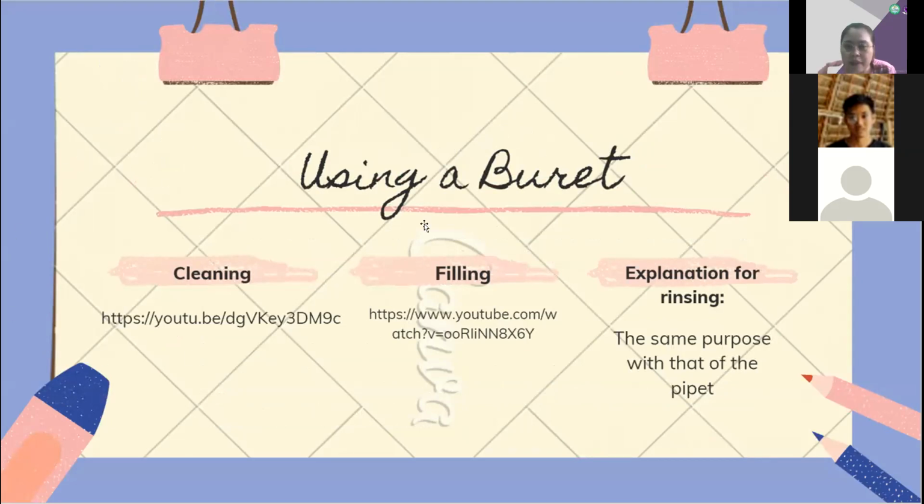So hindi ko na ipapakita yung video kasi pinakita naman na ito ng reporters just a while ago. Now in cleaning, just like the pipette, if there are film breaks of water inside the burette, that signifies that the burette is dirty. Kailangan natin siyang i-clean.